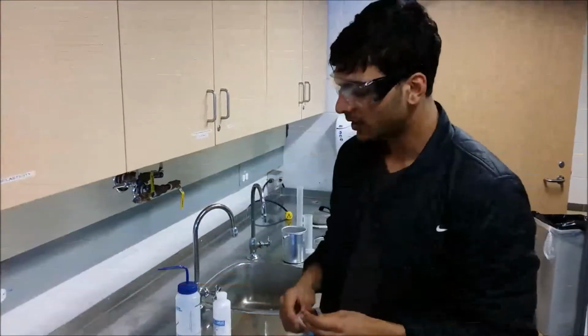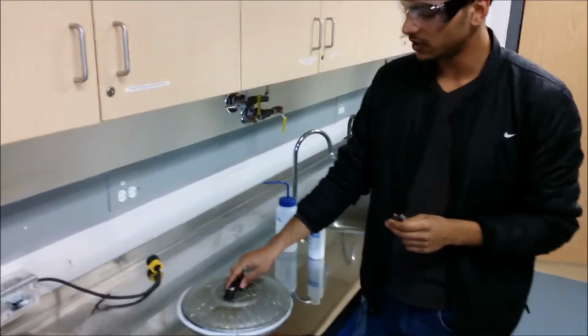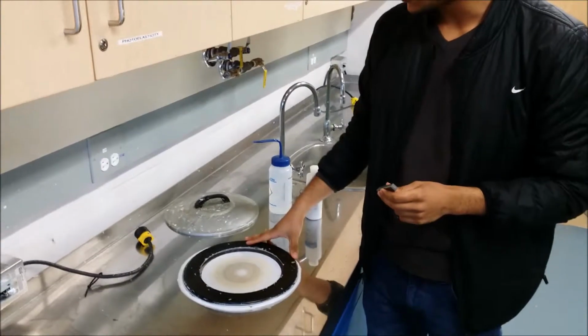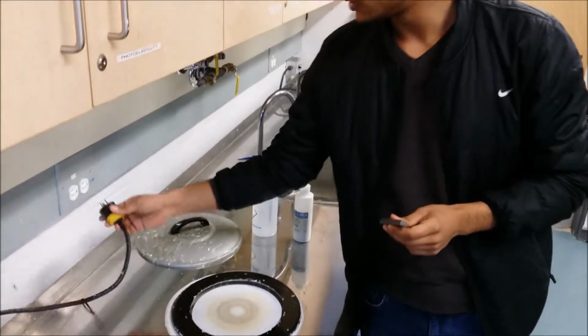After the process of grinding, it's time for the polishing. This is done with the aid of this polishing wheel. Actually, you can say it's a moving sandpaper, so it polishes the surface. Let me turn it on.